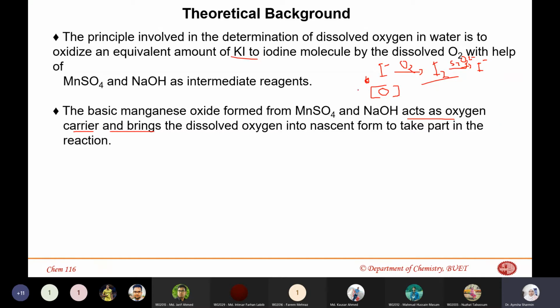Okay, so to create this from the oxygen, we are using manganese sulfate in sodium hydroxide solution. In alkaline manganese solution, manganese can do that. Okay, so this is the process. First, the manganese sulfate, this is 2+, right? It's forming the manganese hydroxide. There is nothing else here, it's just a simple substitution reaction, right? Nothing else is happening here. No oxidation number or anything is changing here.